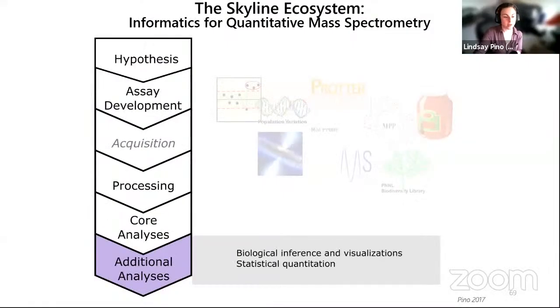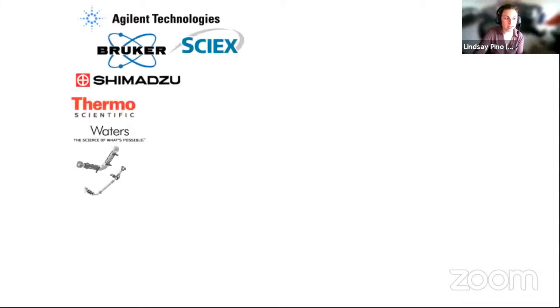Okay, so that's kind of reached the end of what we wanted to mention as a very quick wrap up for this kind of lecture-based section.